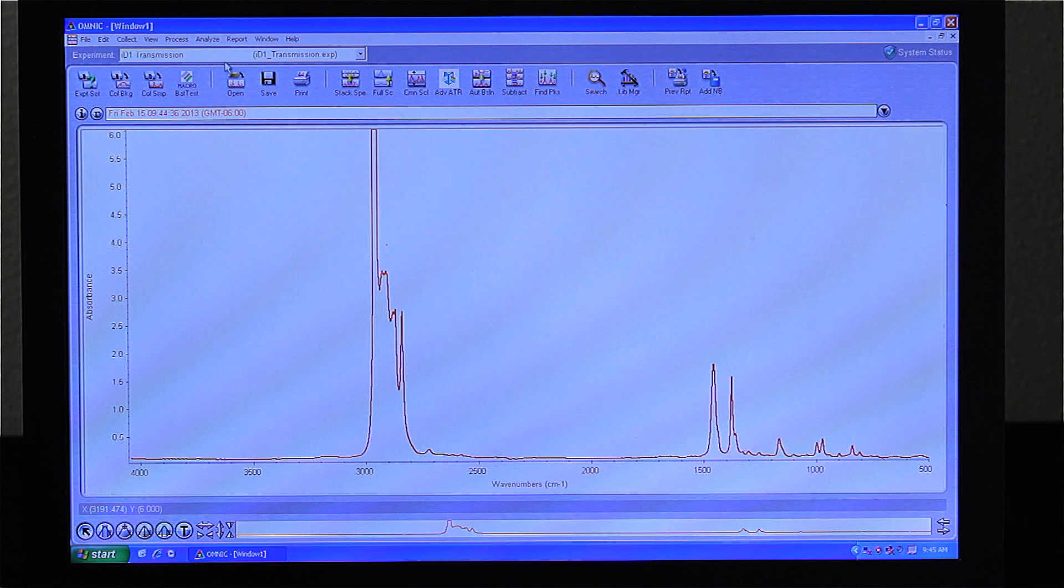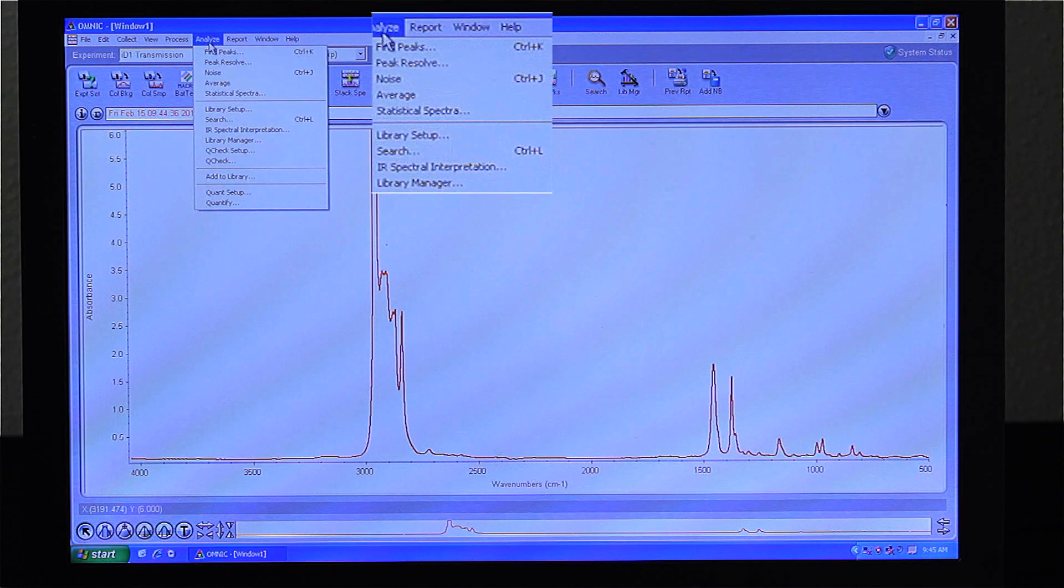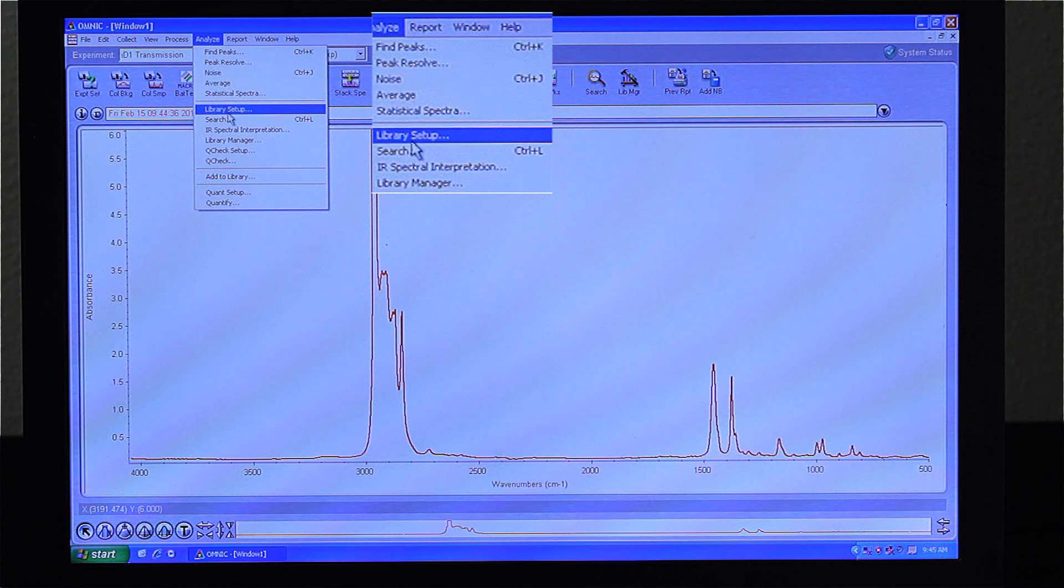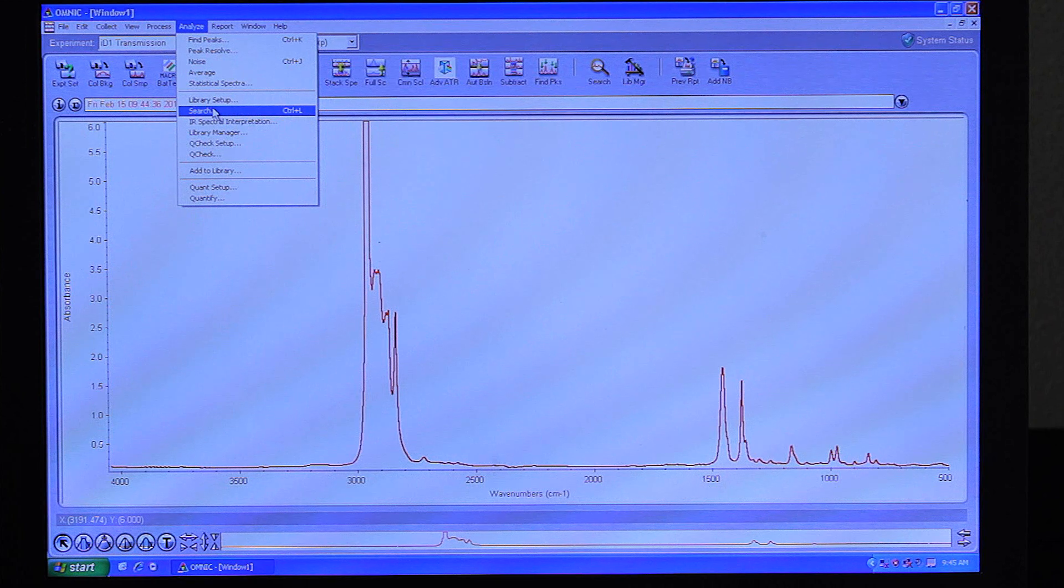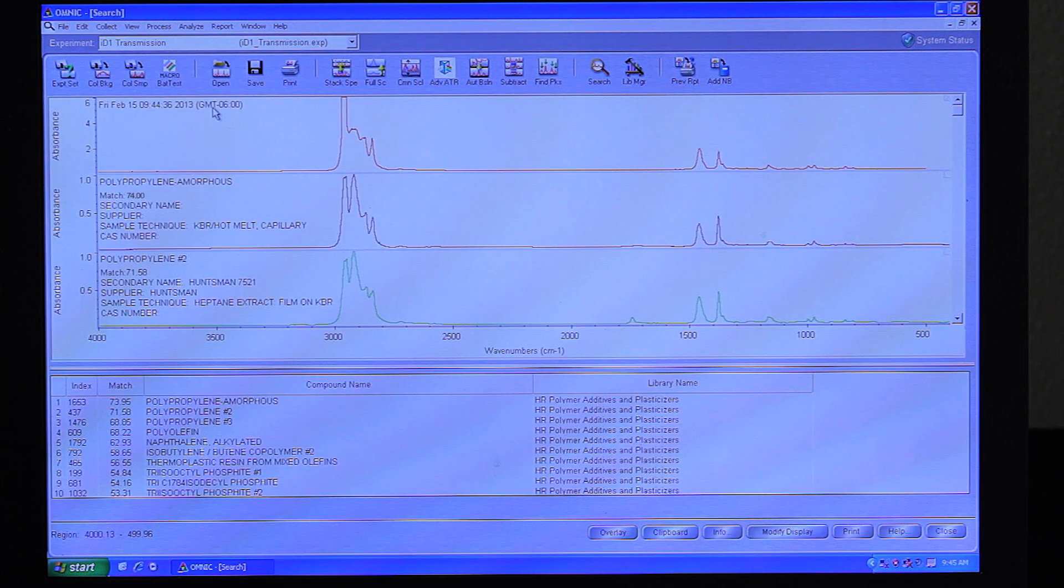To do a library search, you go up to Analyze, go under where it says Library Setup, and then hit Search. Our libraries will tell you what the best match is for this particular spectrum. We can then be fairly sure that our material is actually polypropylene.